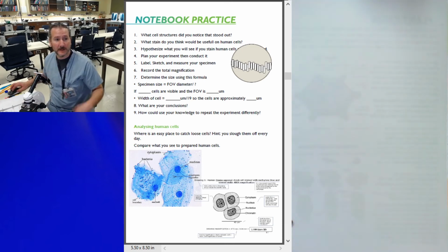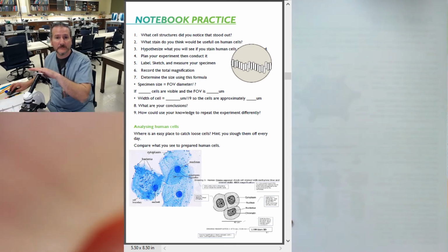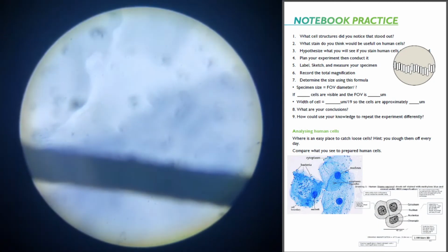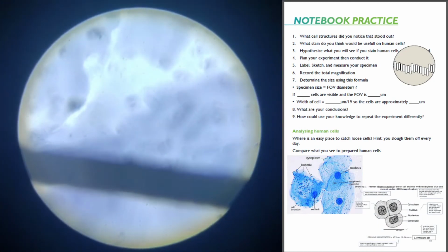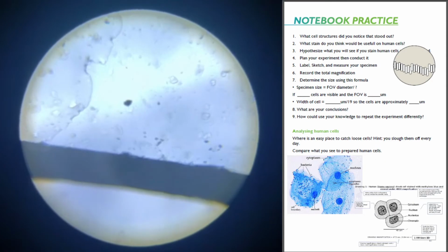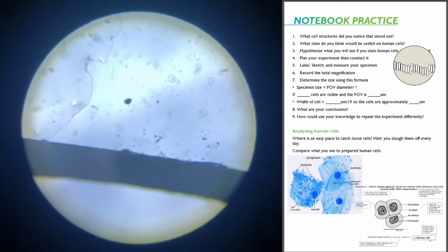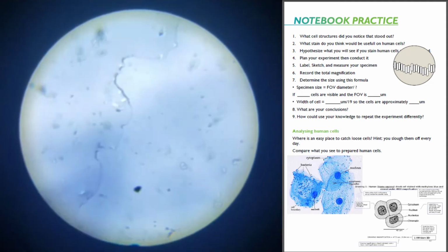Turn on my camera again. Let's see what we find. There's the edge of the slide. Decent looking edge. Okay. Bring it down.